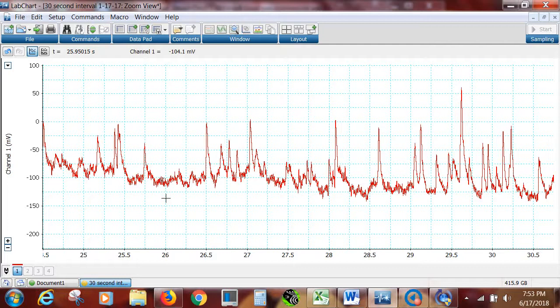To 26. I just count 1 in there. You might count that something, but I wouldn't. And then 26.5, that's 1. 26.5, that's another 1. Get the idea? 26.5 to 27.